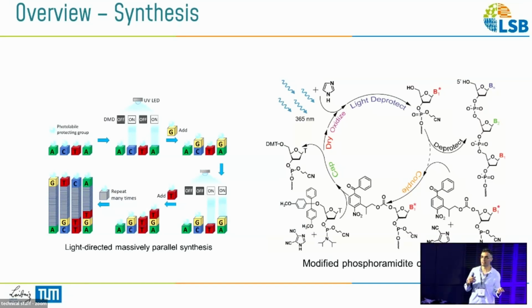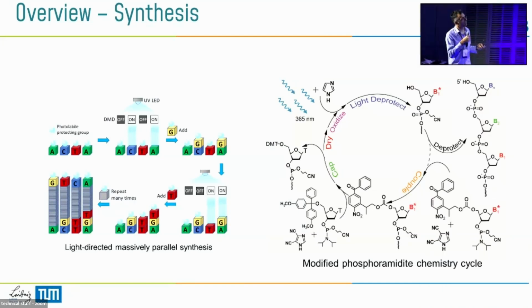Phosphoramidites are, let's say, simply nucleotides which have a lock on the top, a cap on the top. And that lock, which is shown as a sphere here, can be deprotected, unlocked, or removed by UV light. And this is the part where UV can work. So imagine at the surface, at the first round, we have these nucleotides, which all have their own lock. If we turn on the UV light at this position and at this position, those locks are unlocked, those caps are removed, and the hydroxyl groups at those parts are available for the next round.